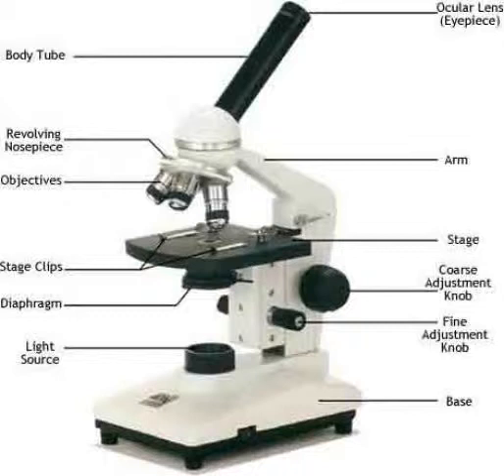Number 3. Turn the nose piece so that the low power objective is in place. Focus under low power using the coarse focus. You should be able to clearly see the letter r on the slide. Number 4. Draw the letter on low power, showing the appropriate details and following the guidelines for lab drawings. Number 5. Center the letter in the middle of the low power field. To use the high power objective, first center the slide and focus.